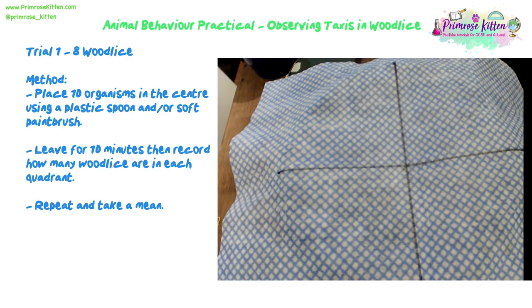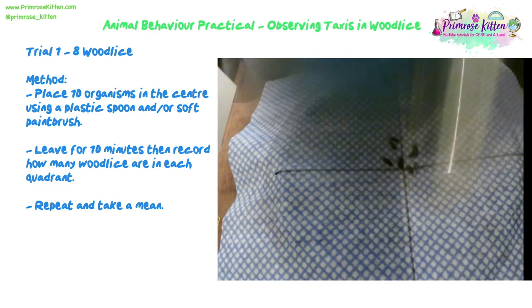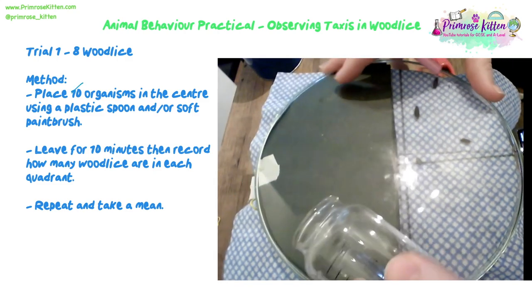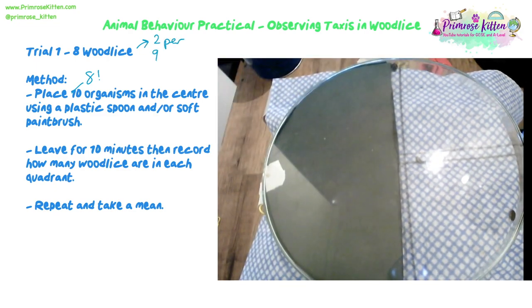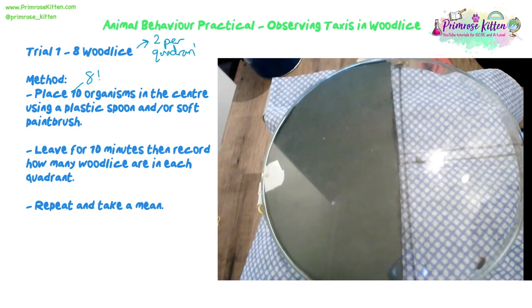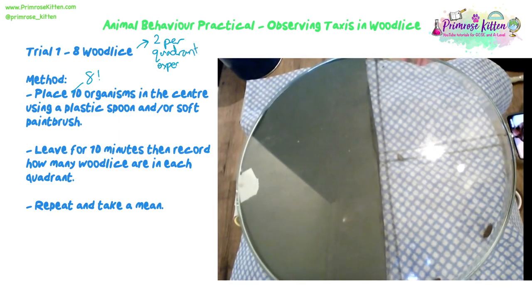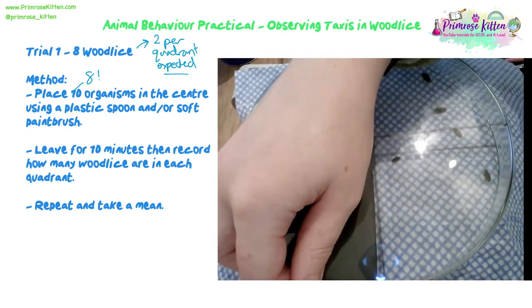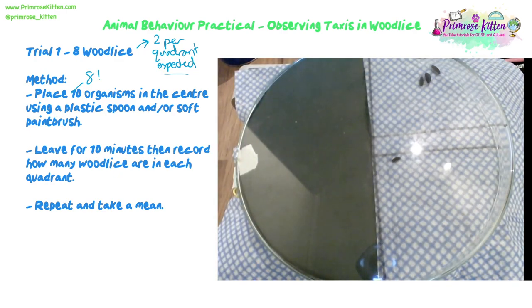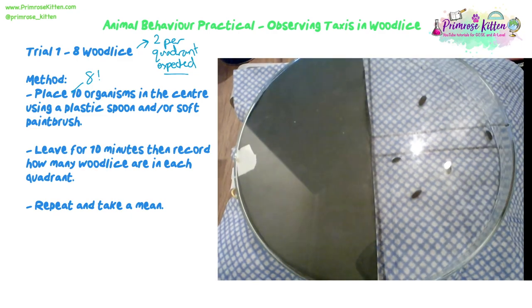I have eight wood lice tipped into a small vessel so I can tip them all into the middle at once. I'm going to quickly put the lid on because they run very fast. I'll tip them straight into the middle and then quickly put the lid on making sure the dark side is oriented correctly. Now we set the timer for 10 minutes and see what happens.